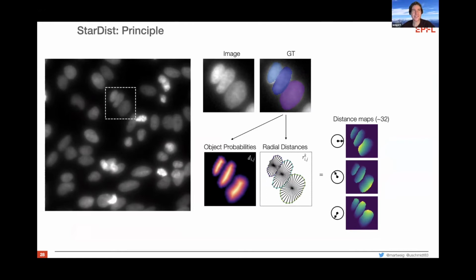As long as, essentially it doesn't care if you're inside of a solid object or inside of a hole that only sees the membrane. As long as your field of view, and we will come to that later, as long as the network sees the whole object, it knows. If the network at this position is able to see the border, it can infer the distance to this border, right? And that's the only thing that matters.